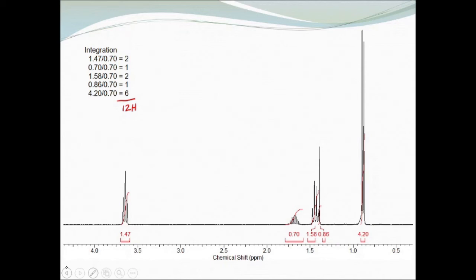You're being told that, but in the absence of that knowledge, you could use an infrared spectrum. So again, we're looking at a peak that has an integration of 1. We have 2 such peaks. This one was 1 hydrogen, and this one is 1 hydrogen. But the second criterion for whether or not a peak is OH is that we almost never see splitting between the OH and anything adjacent to it. Those are almost always singlets, so that takes this out of play. So the singlet here is going to be our OH.